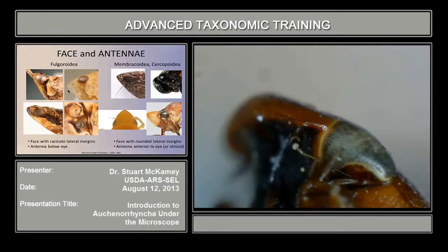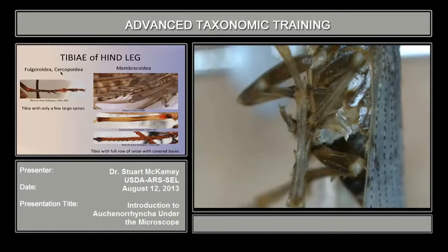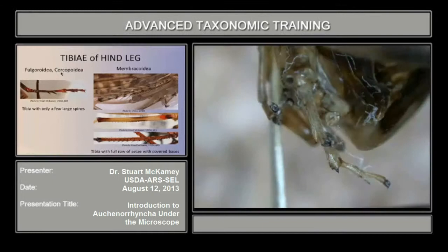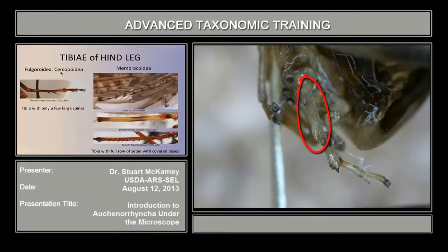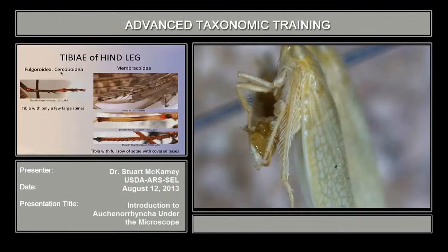Going to the third slide, we'll look at the hind tibia, first of planthoppers and froghoppers. In planthoppers, the hind tibia has just a few large spines. In froghoppers, the hind tibia also has just a few large black-tipped spines along it. That condition distinguishes it from the hind tibia with a row of many spines — sometimes they're fairly large, but there are always many of them along the hind tibia.